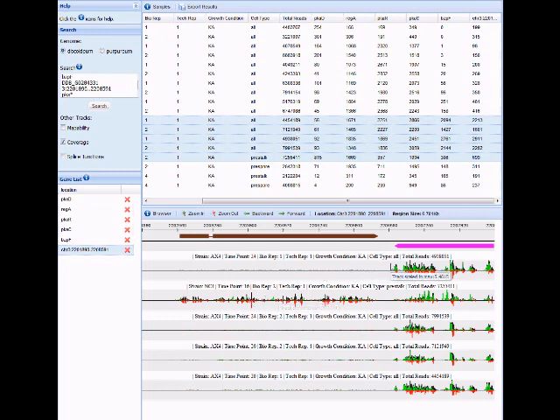For each of the tracks, you see the number of reads that map to the positive strand in green, the negative strand in red, and then the sum of the two as black.